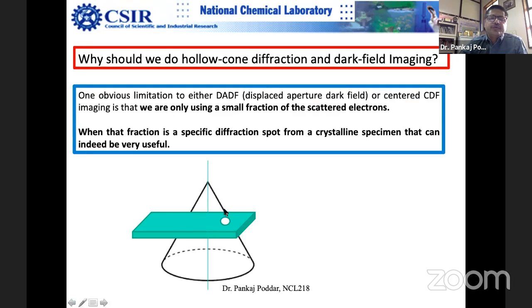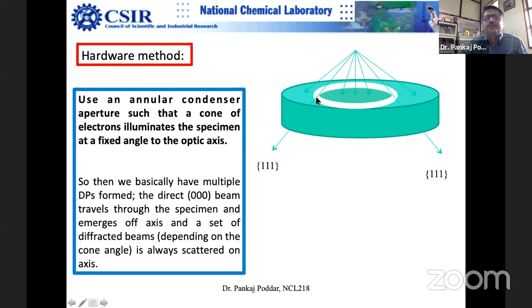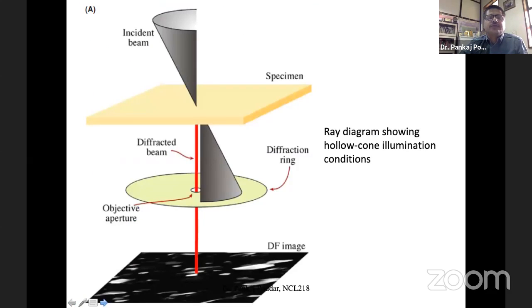So basically, if you rotate this aperture, it becomes an annular aperture, right? So rather than you just rotate it, it becomes like that. So it becomes like this. It's a very smart idea actually. And these days it can be done by software. Software does it for you.